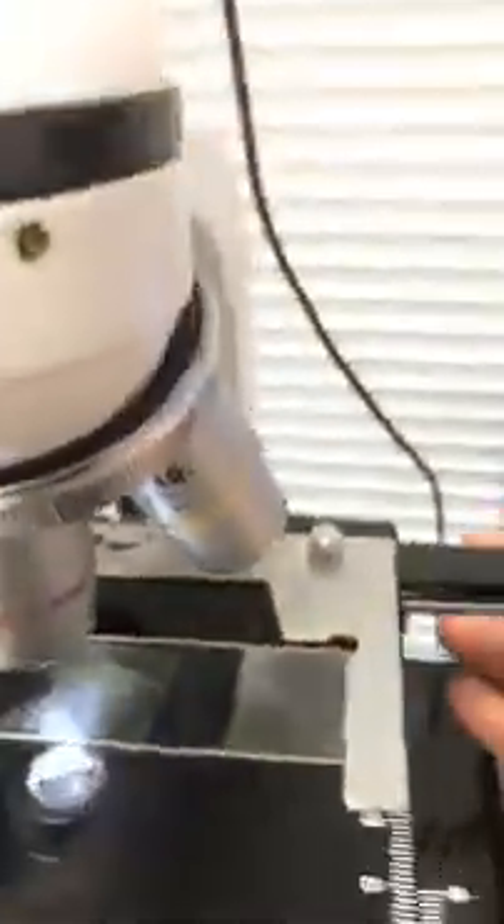It's a female — she's full of oil and bacteria and faeces. What I'm going to attempt one-handed is to zoom in for a closer look.